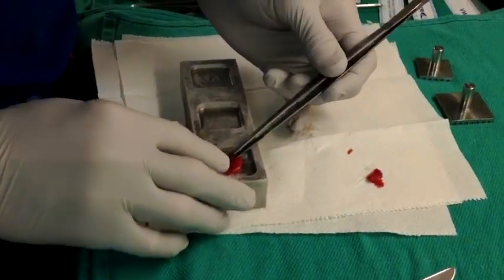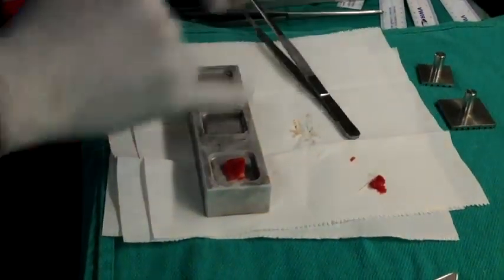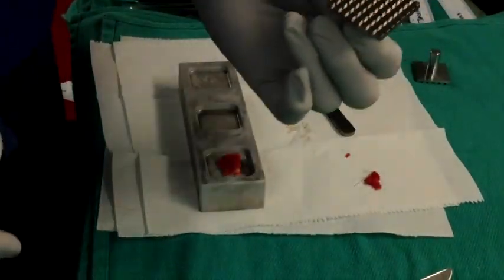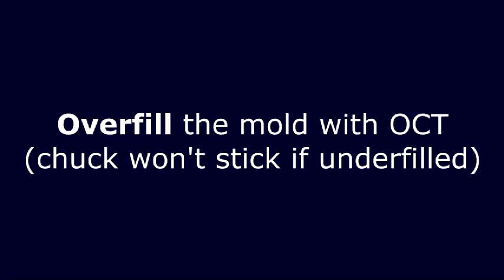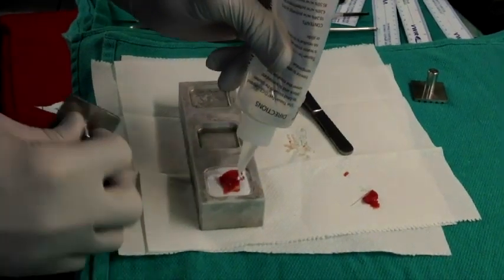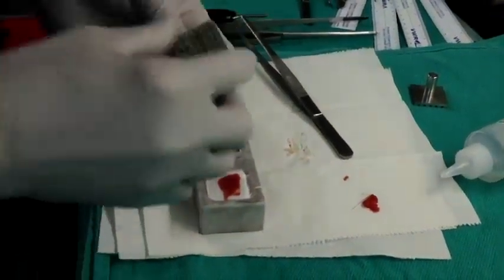I'm going to touch it right there and flatten it down. Now I have about a 3 to 5 millimeter border around the outside. I'm going to take my OCT and my chuck and fill this up to overflowing. When you put the block on top, you want the OCT to ooze out from between these grooves, which is going to help the block adhere and prevent it from popping off inadvertently.